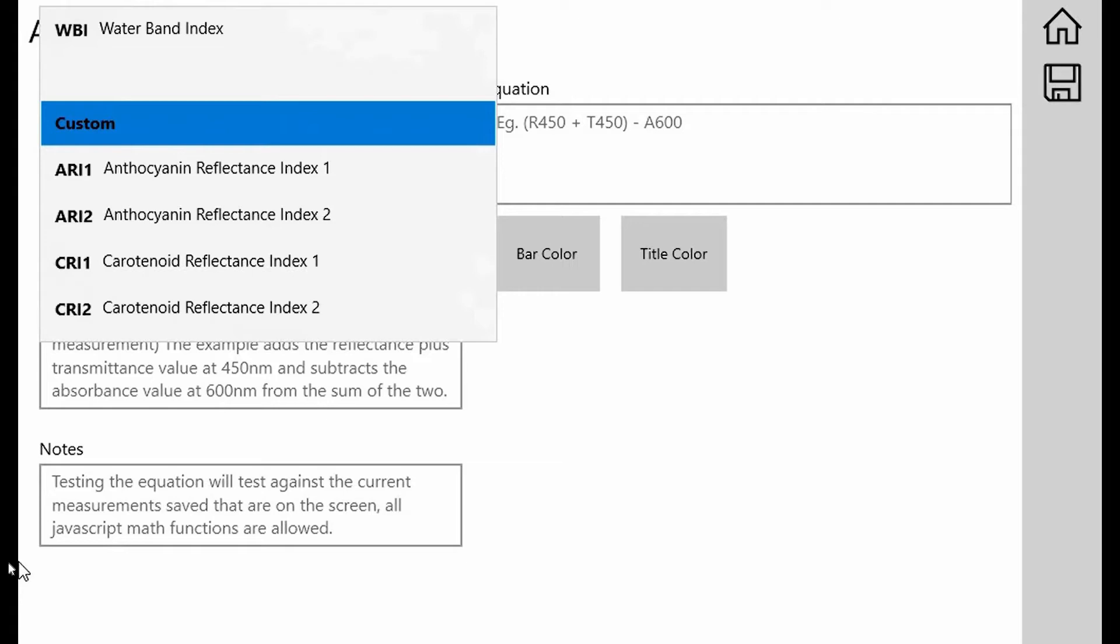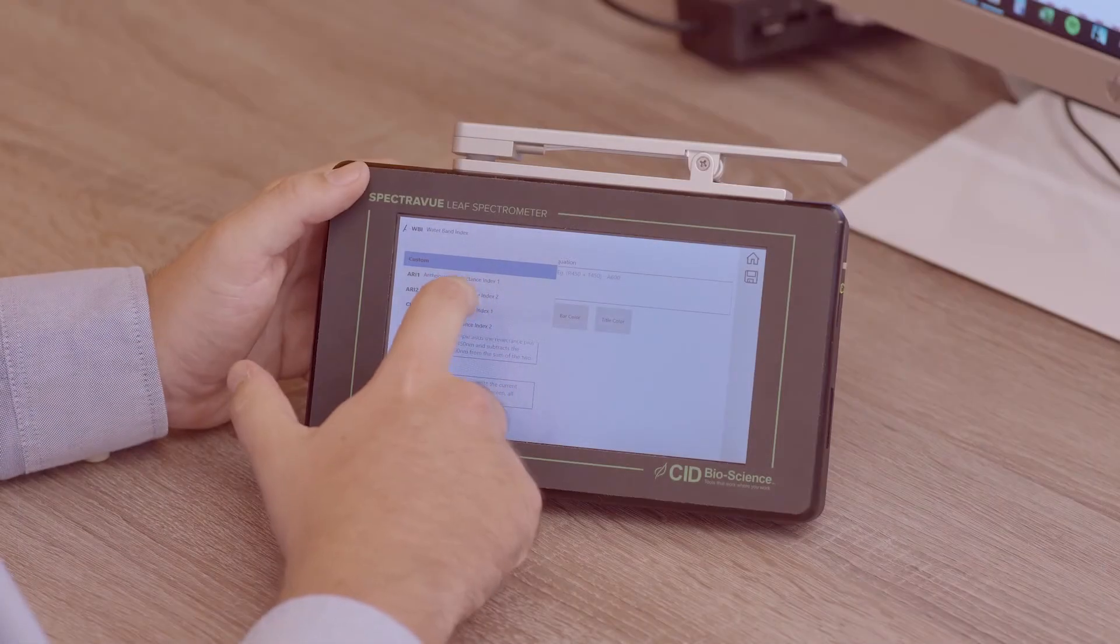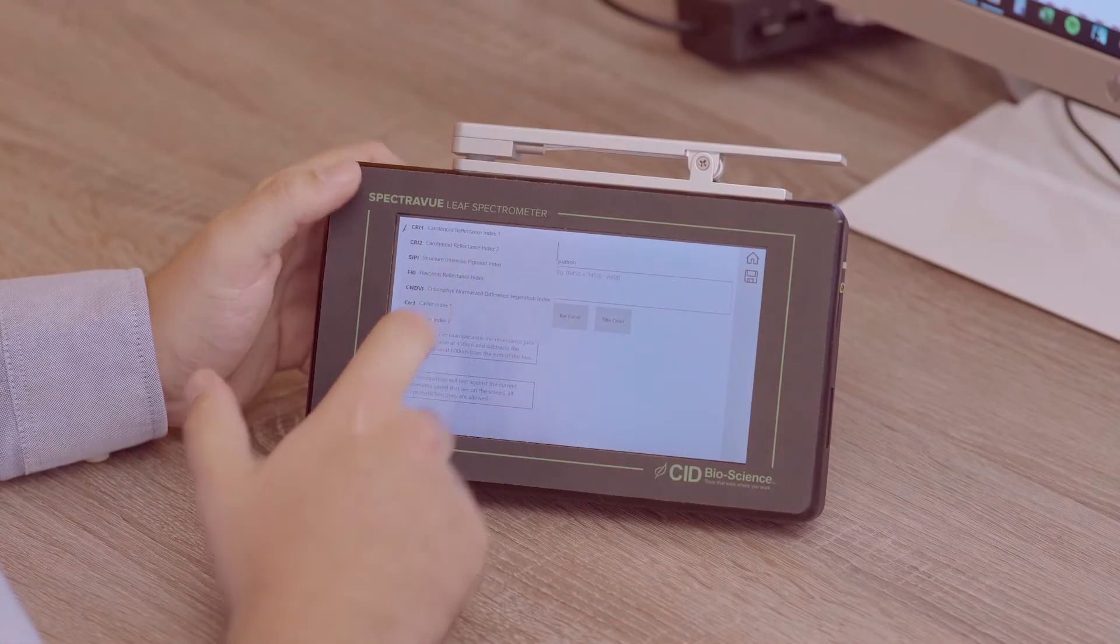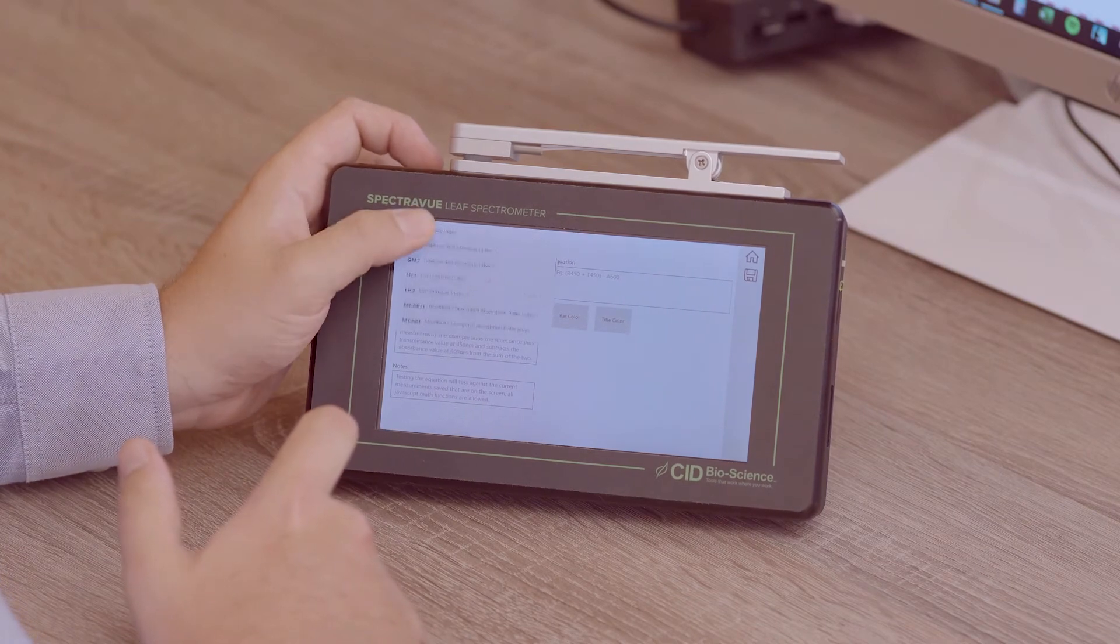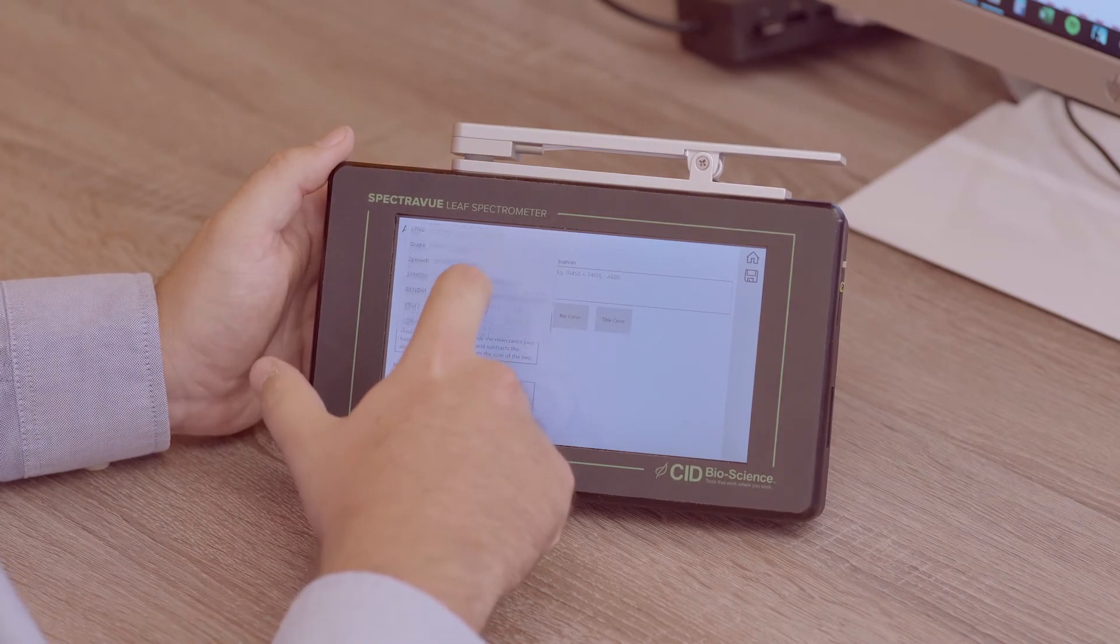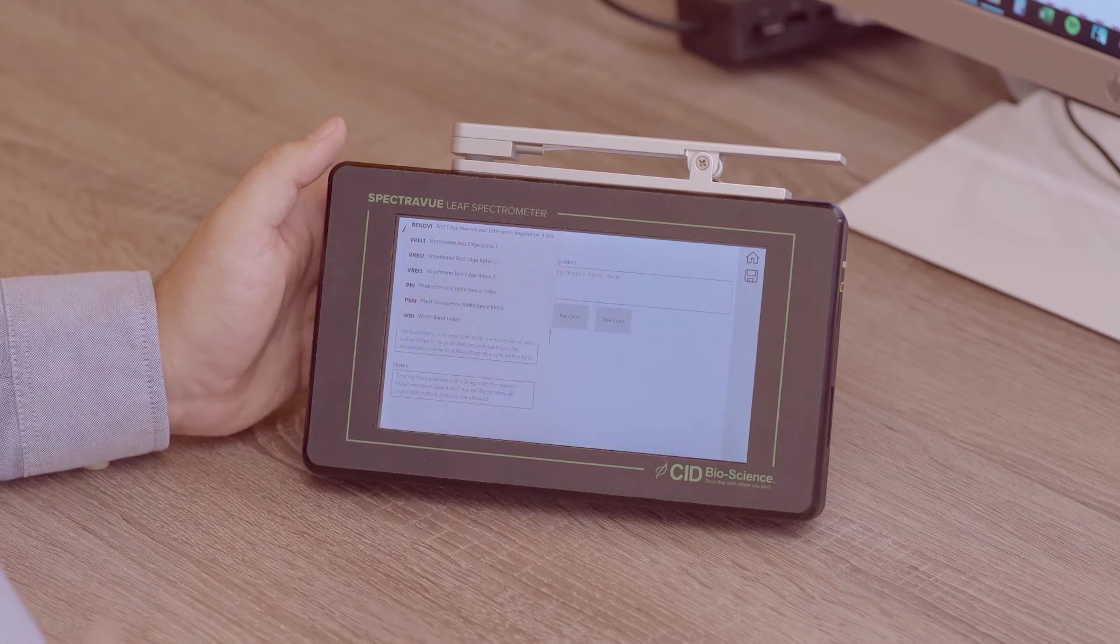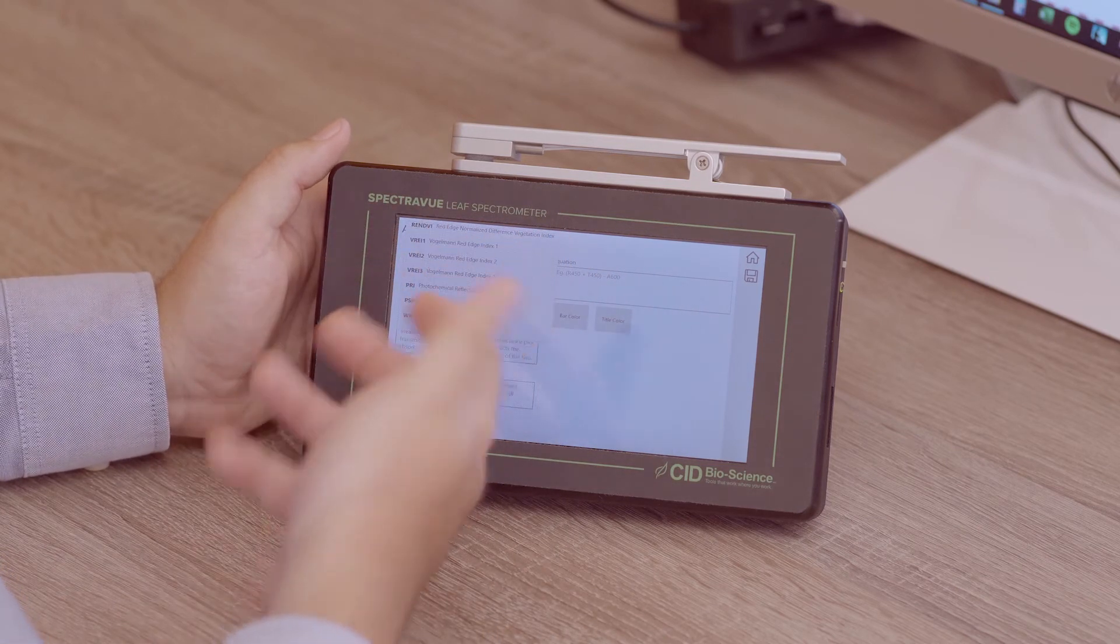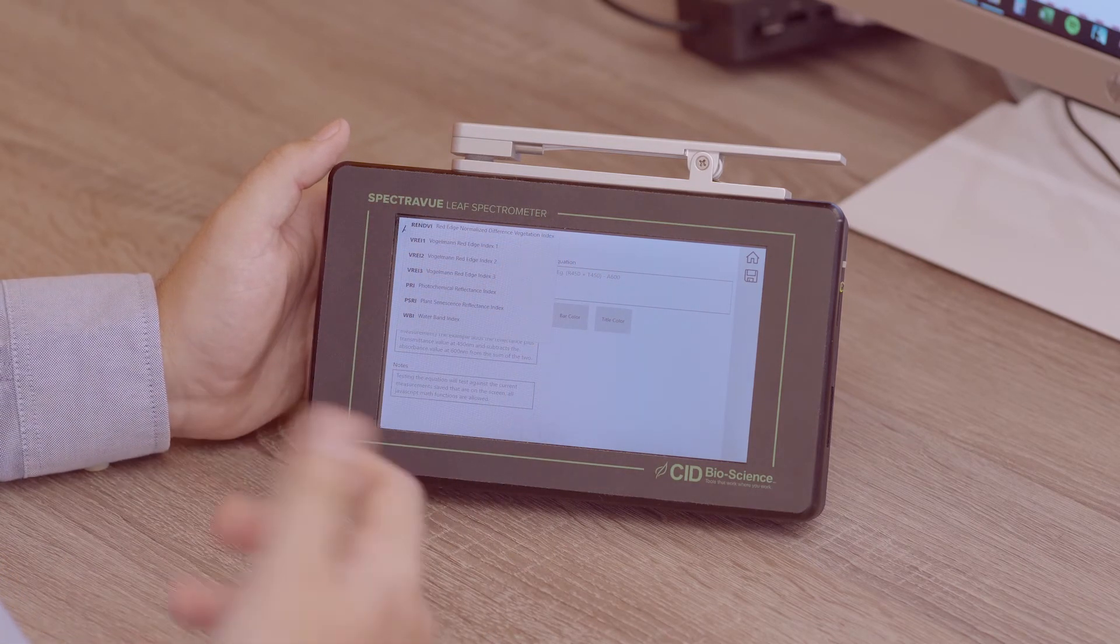Right at the top we can see anthocyanin reflectance index 1, anthocyanin reflectance index 2, the carotenoid reflectance index 1 and 2, and then if you scroll on the touch screen you can see there's plenty more built-in indices here, all the way down to the photochemical reflectance index and the plant senescence reflectance index.